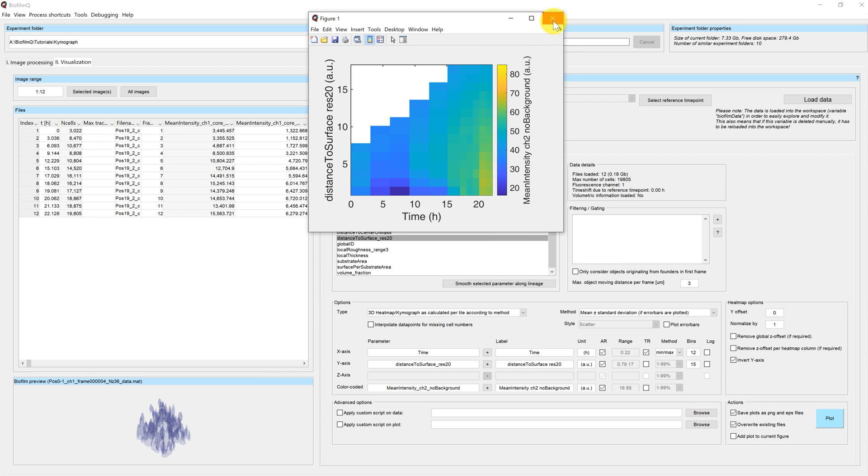So this visualization now shows you your reporter activity over time and in a spatial resolution.